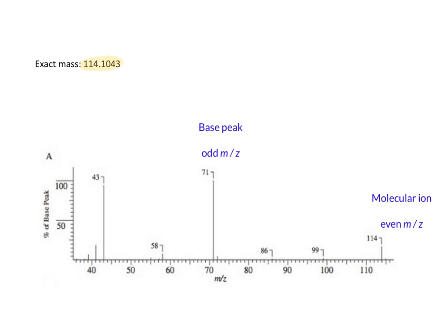My preliminary hypothesis is that this compound has the elements carbon, hydrogen, and oxygen. Moreover, with the relatively large deviation from the integral value, the molecular ion probably contains quite a few hydrogens. Let's work systematically through the exercise. So if we divide this number by 12, this gives 9 carbons and a remainder of 6 hydrogens as our preliminary spectrum.